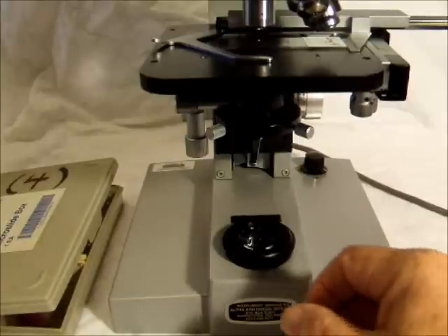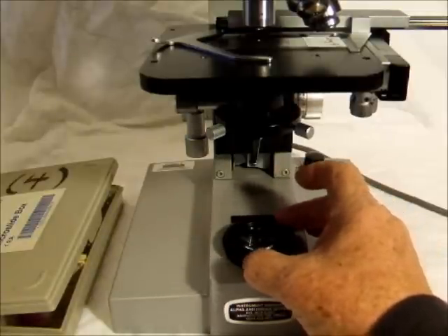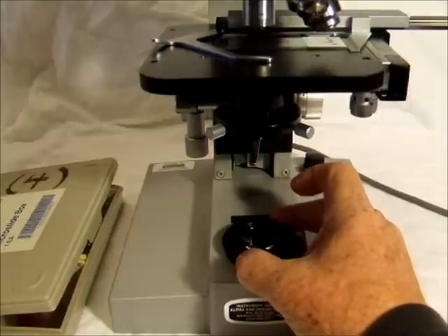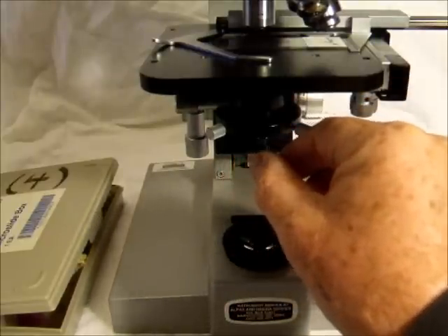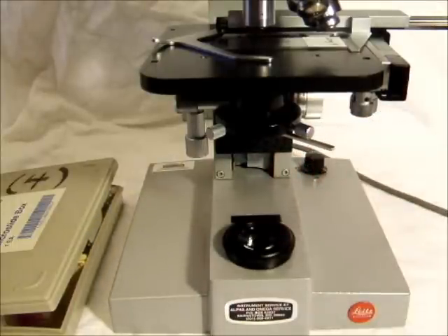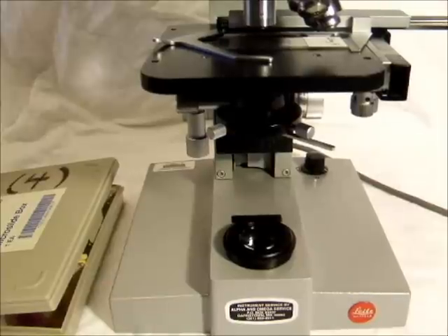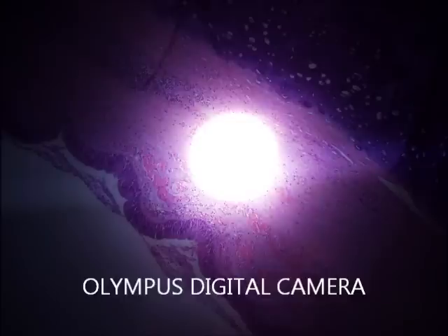Step 6. Close the light diaphragm all the way down, and at the same time, close down the condenser diaphragm by pushing the armature to the right. At this point, you should see a small spot of light in the ocular lens. If necessary, center this spot of light using the centering screws located on the condenser.